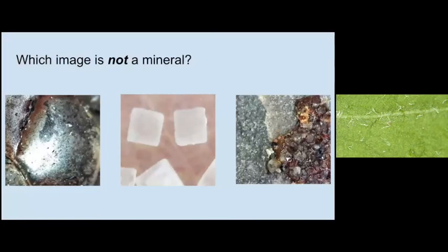We're doing another one. So here we have 3 images. 2 are minerals, which means they come from the earth and they're not living. And 1 of them does come from a living thing. Does anyone have any observations they want to share?